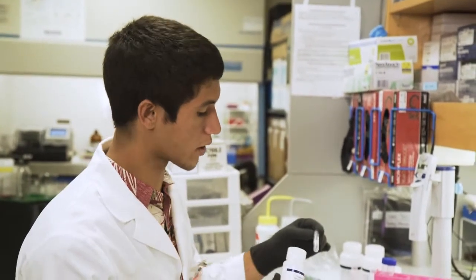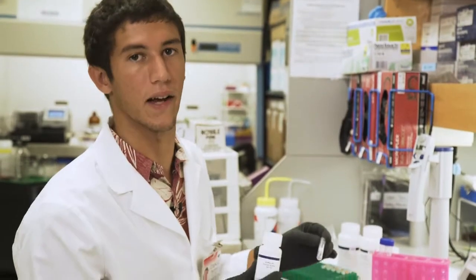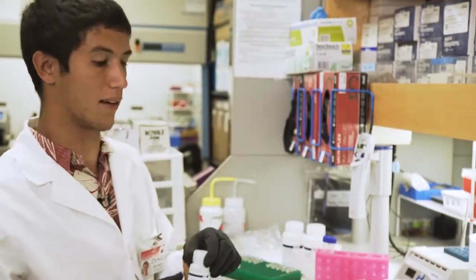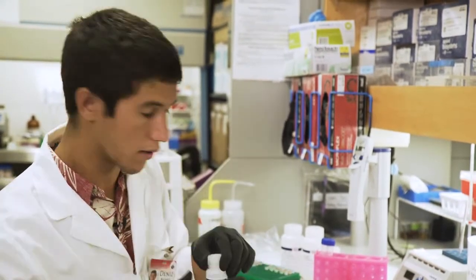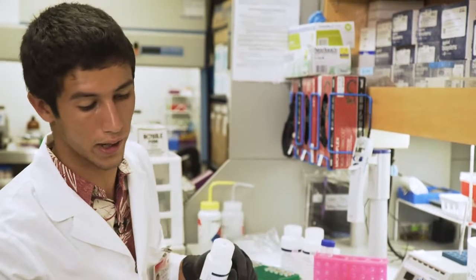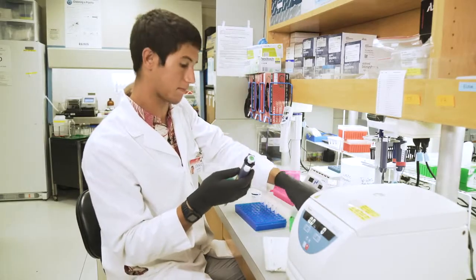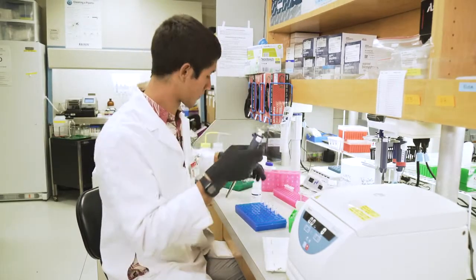I'm going to go with 100 just because I've done this enough times that I know 100 will be enough for what we need. You don't need a whole lot of volume. It's better to have a higher concentration in it. So the more volume you add, the more total product you have, but it's more dilute. More pipetting, same as before.